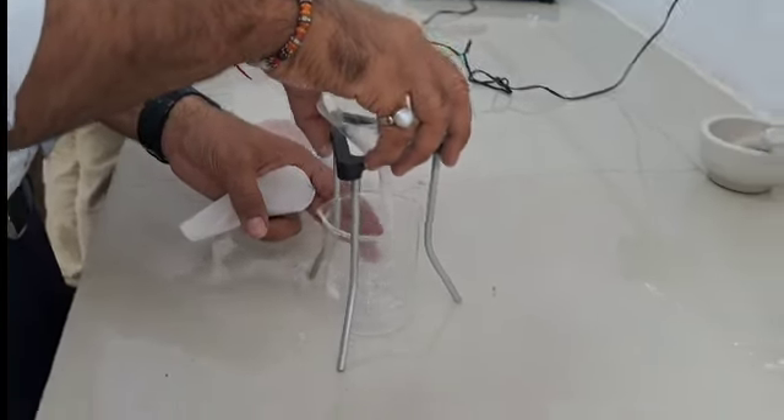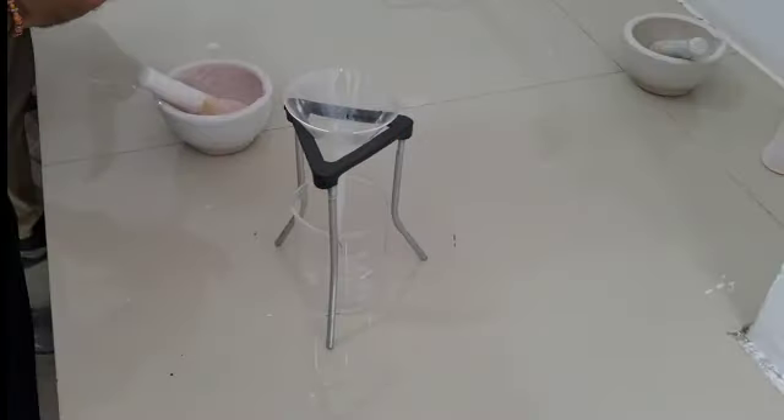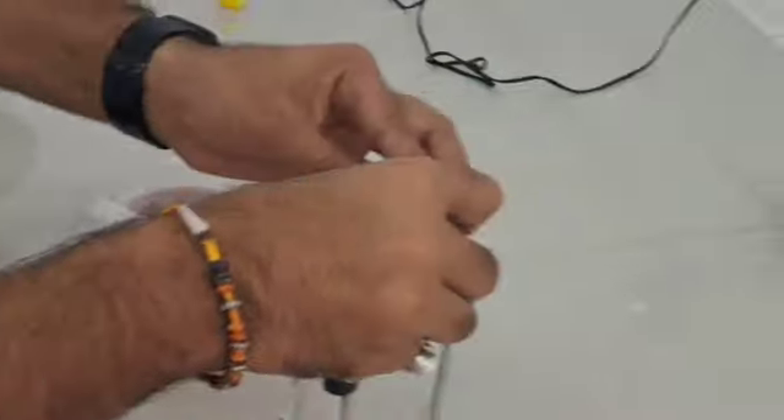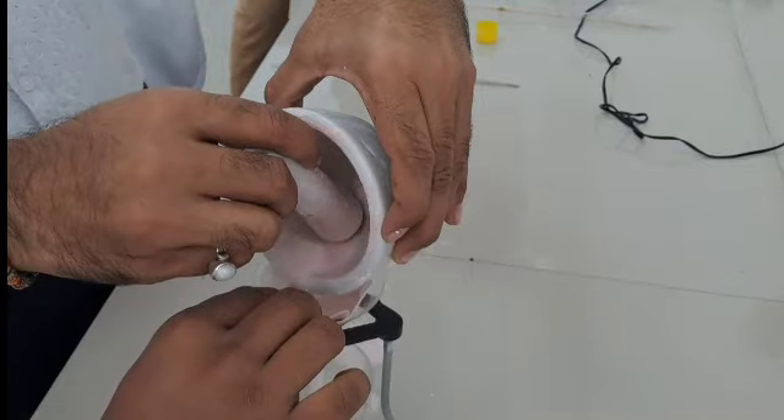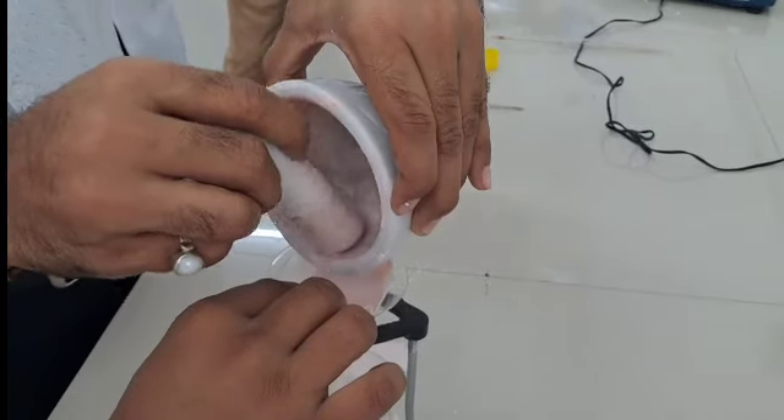For filtration, place a funnel on the tripod stand, take a filter paper and place it on the funnel. Now pour the solution into the funnel and let it filter.